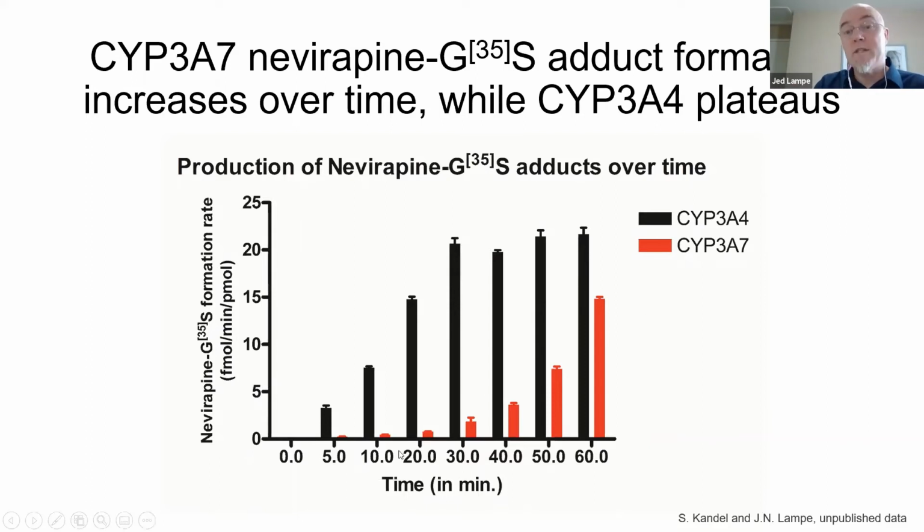In comparison with CYP3A7, although there's a lot less of that reactive metabolite produced because it's just less efficient at turning over the drug substrate, over time, you don't see that plateau, at least over the 60 minutes that we did this assay.